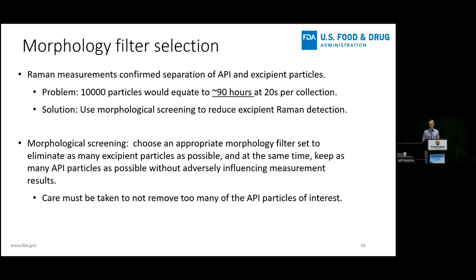Again, you don't have to. If you want to shoot particles for ID, and you could just hit excipients the whole time, I mean, go for it. You'll still get an API particle size distribution, but you can reduce the time significantly by using filter selection.